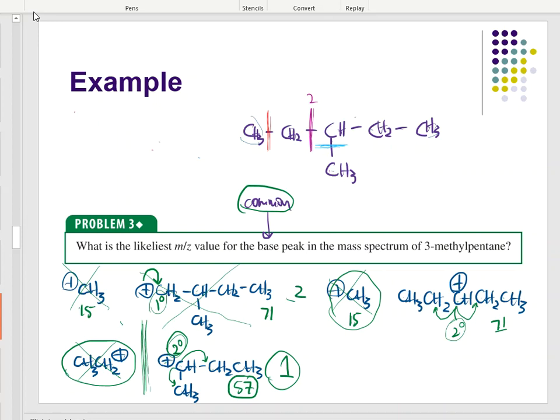In this scenario, if the molecule cleaves like we've drawn it here, I have a 1-carbon piece and a 5-carbon piece. If the molecule has a choice, it's going to send them out with pairs. It's going to send them out with buddies. It doesn't like for this little CH3 to be alone. This thing is not very stable.